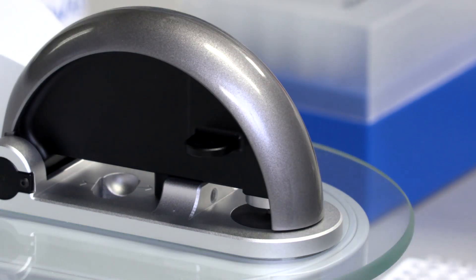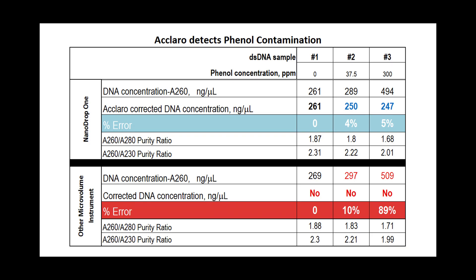When comparing data from a NanoDrop One instrument to a competitor spectrophotometer, you see the Acclaro software provides you with accurate nucleic acid concentrations even when phenol is present in your sample. The competitor instrument cannot correct for the presence of phenol and provides you with an overestimate of nucleic acid content.